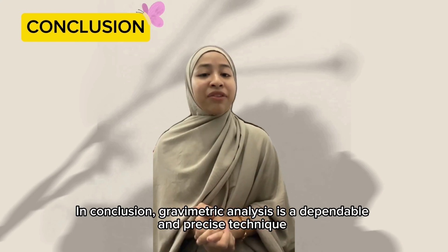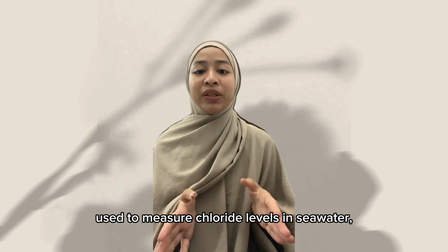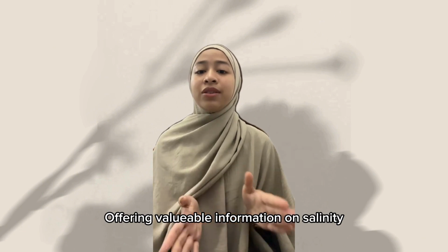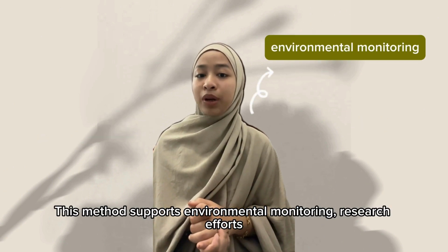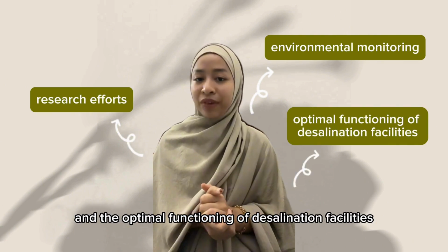In conclusion, gravimetric analysis is a dependable and precise technique used to measure chloride levels in seawater, offering valuable information on salinity and the ecological health of marine systems. This method supports environmental monitoring, research efforts, and the optimal functioning of desalination facilities.